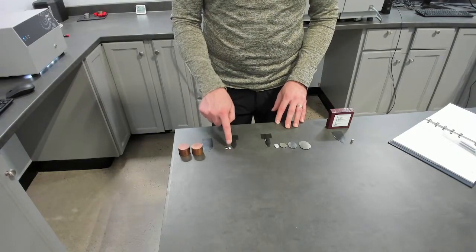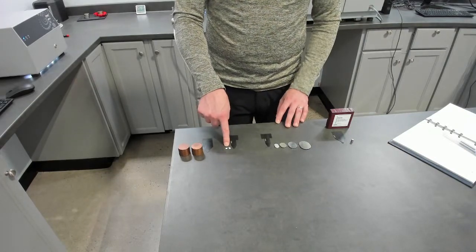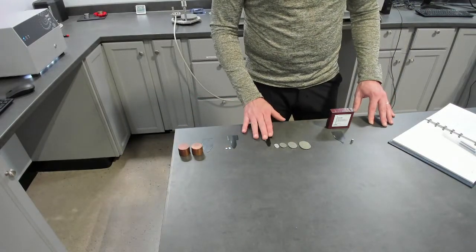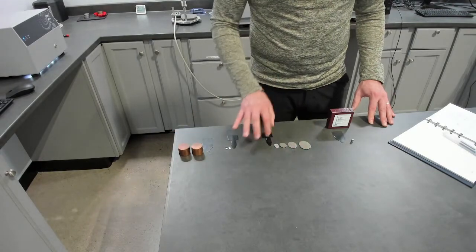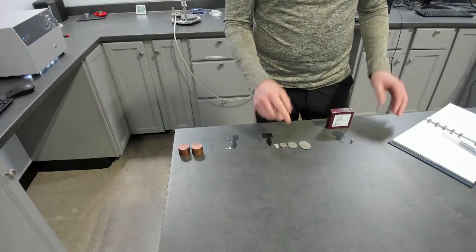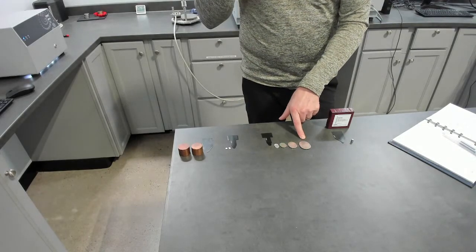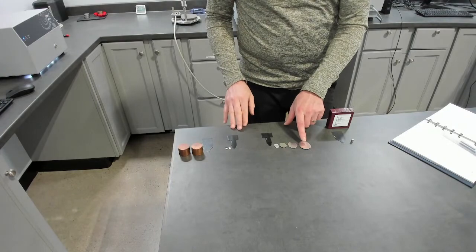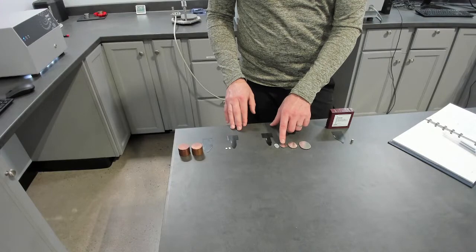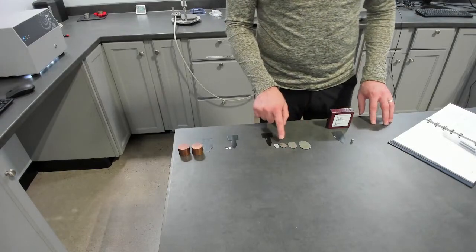The smallest dimension there, in terms of the edge of the sensor to the edge of the sample, is the thickness, 1.5 millimeters. This is a 4 millimeter or 2 millimeter radius sensor. So these are bulk, and the next are examples of measuring highly conductive materials with the slab module. We have a demonstration on the slab module, and we will be doing a demonstration on these specific samples. These are all aluminum, 30 millimeters, 25 millimeters, 19.2 millimeters, and 12.7 millimeters or half-inch diameter, and they're all 1.3 millimeters thick.